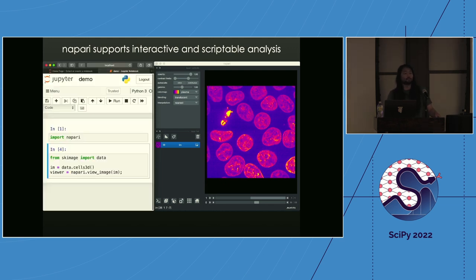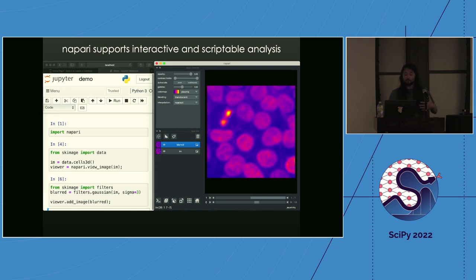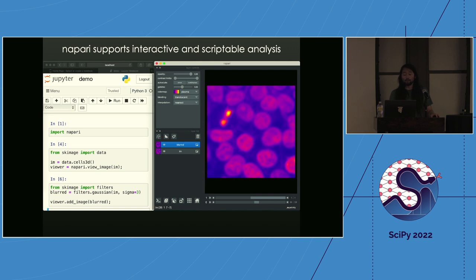Here's a small toy example: you fire up a notebook, load in your images, and pass them to the viewer — that allows you to see the image in the viewer window on the right. You can then take those images, use scikit-image to blur with a Gaussian filter, and add that result to the viewer as a new layer. Just like Photoshop and Illustrator, we allow you to layer visualizations, customize how they're viewed, and turn them on and off.